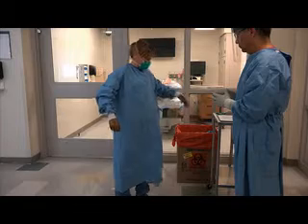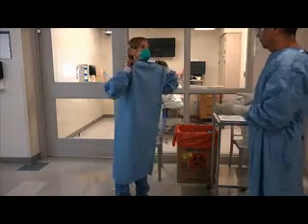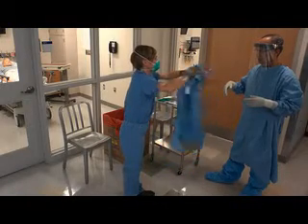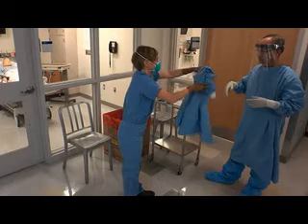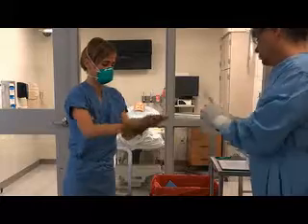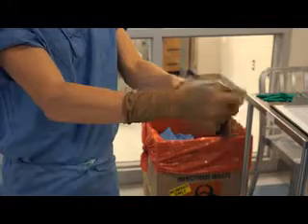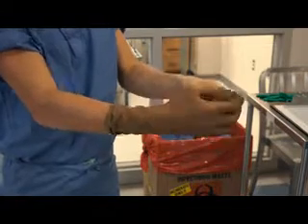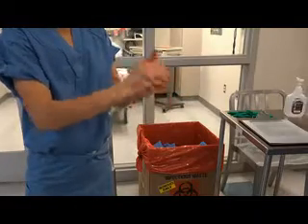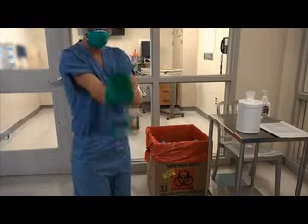Remove your gown by first undoing the fastening at the waist. Grasp the shoulder area and peel the gown away from your body, turning the gown inside out and wrapping it into a bundle. Only the interior of the gown should remain visible. Discard, then disinfect your gloves. Remove your inner gloves as described for the outer gloves, taking precaution to avoid contaminating your bare hands. Use an alcohol-based hand rub for disinfection after taking off the gloves. Put on a new pair of gloves once your hands have dried.